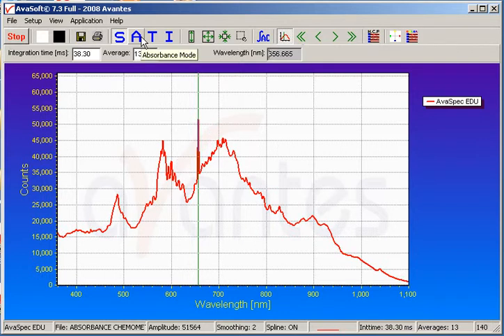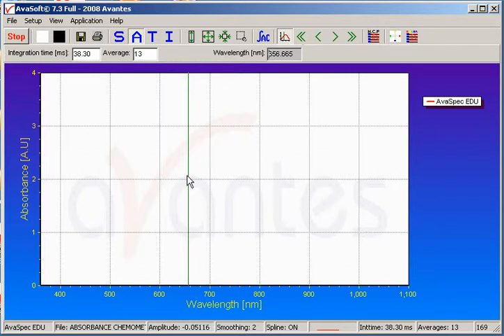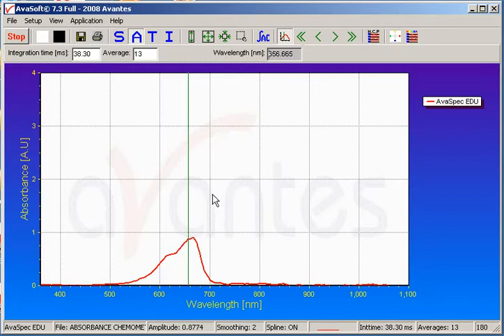Now we can turn the light source back on and move into absorbance mode by clicking the A button in the software. This is where most chemometric and chemistry measurements are taken. This particular technique is based on Beer-Lambert Law, and we are going to create a calibration curve. To begin, we want to identify approximately the center wavelength we are working with.